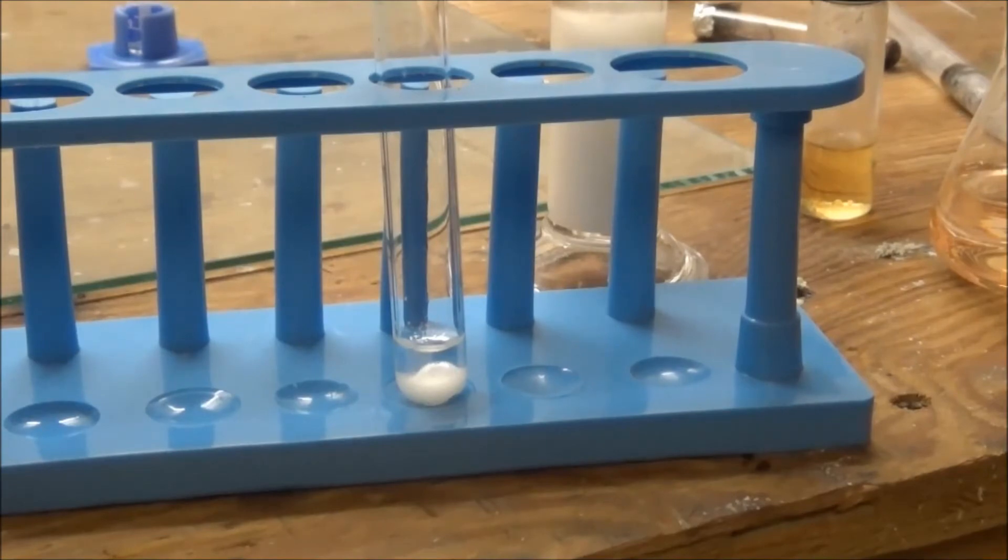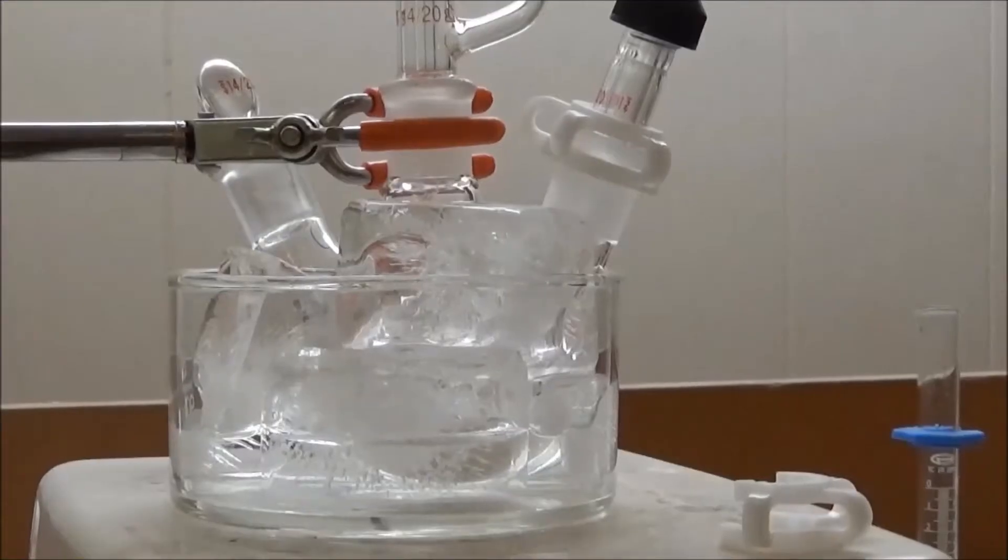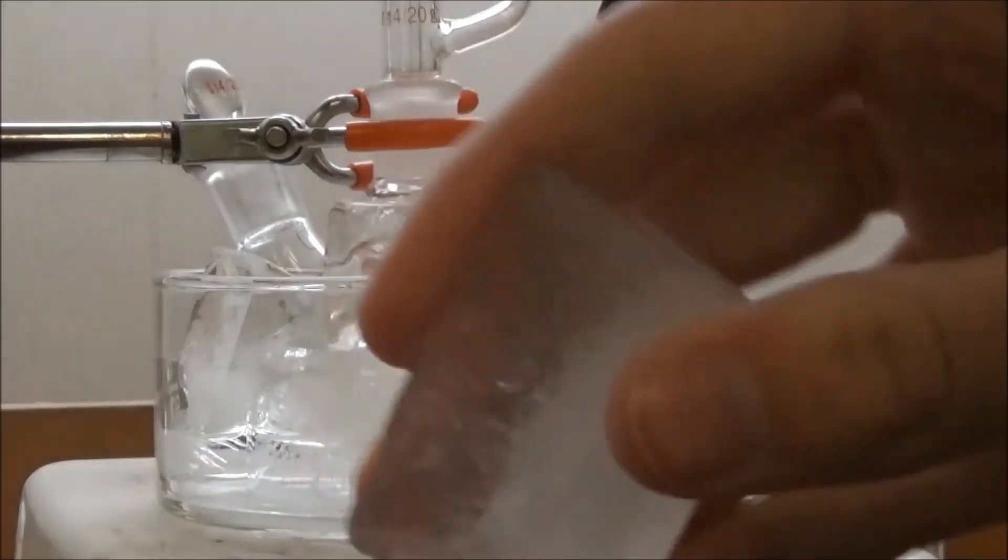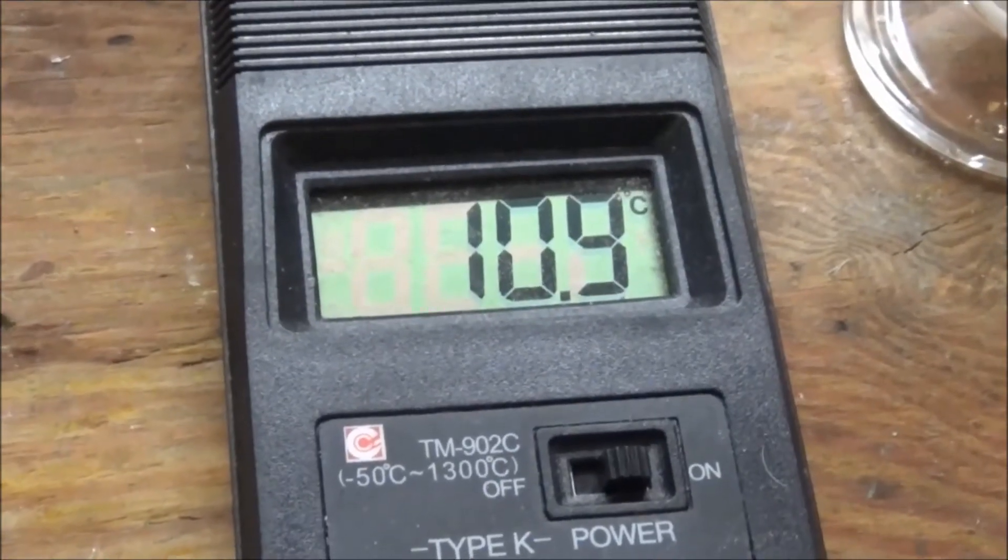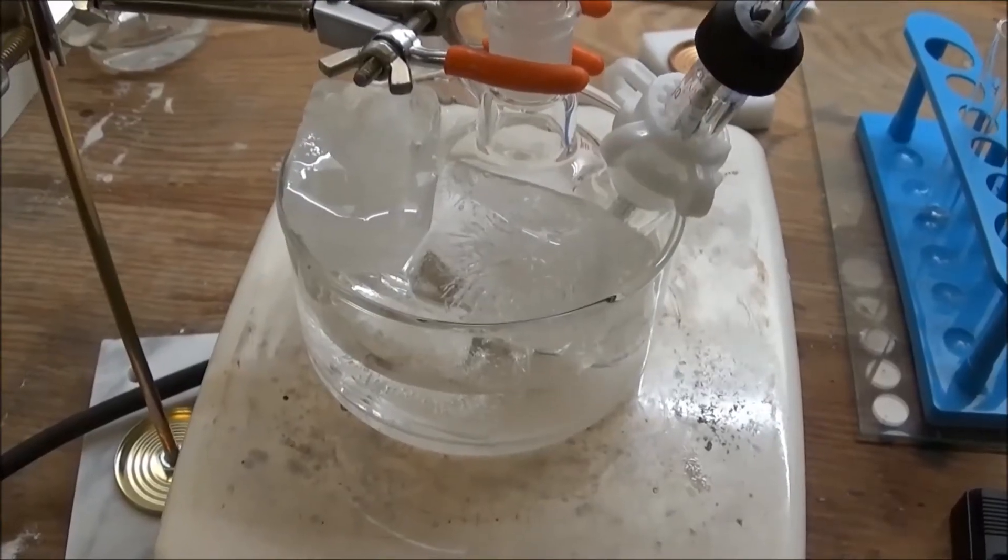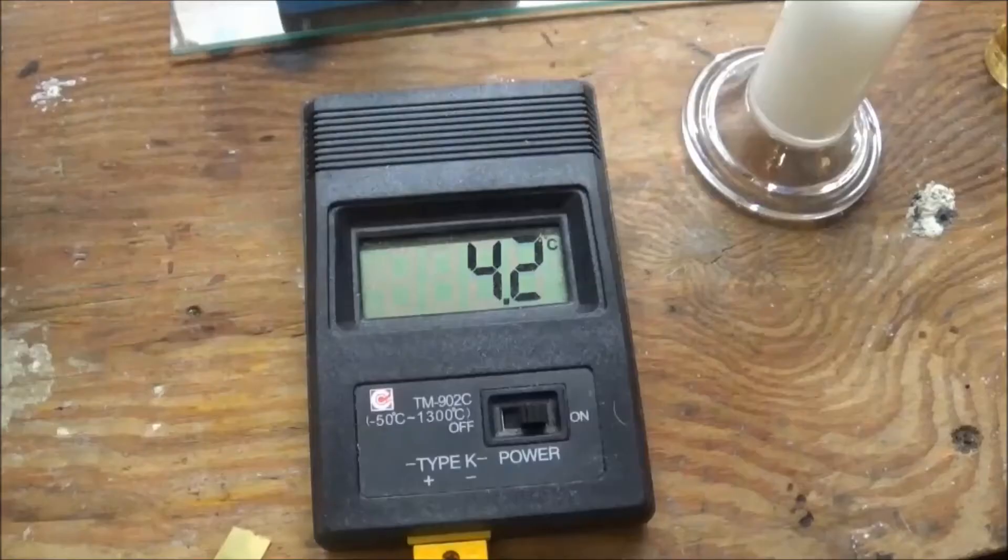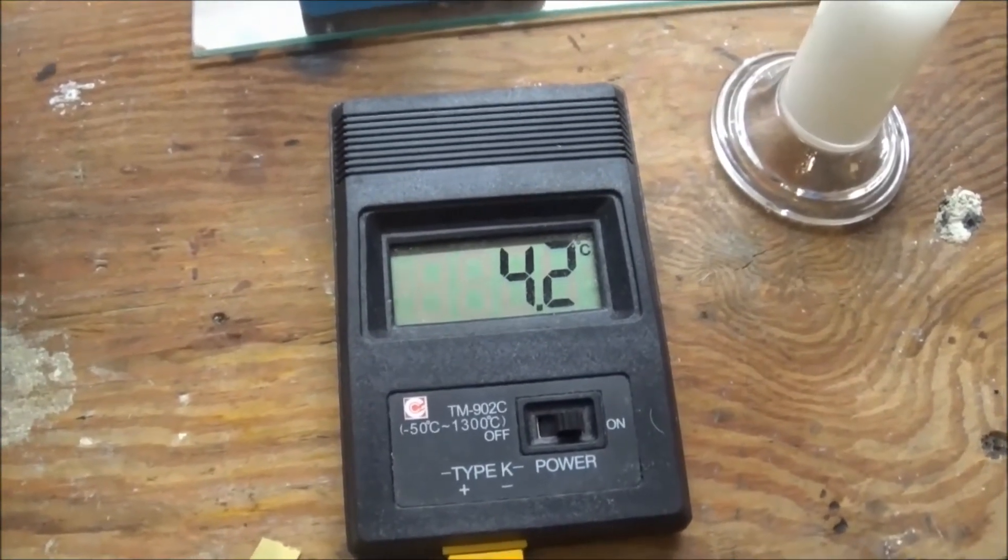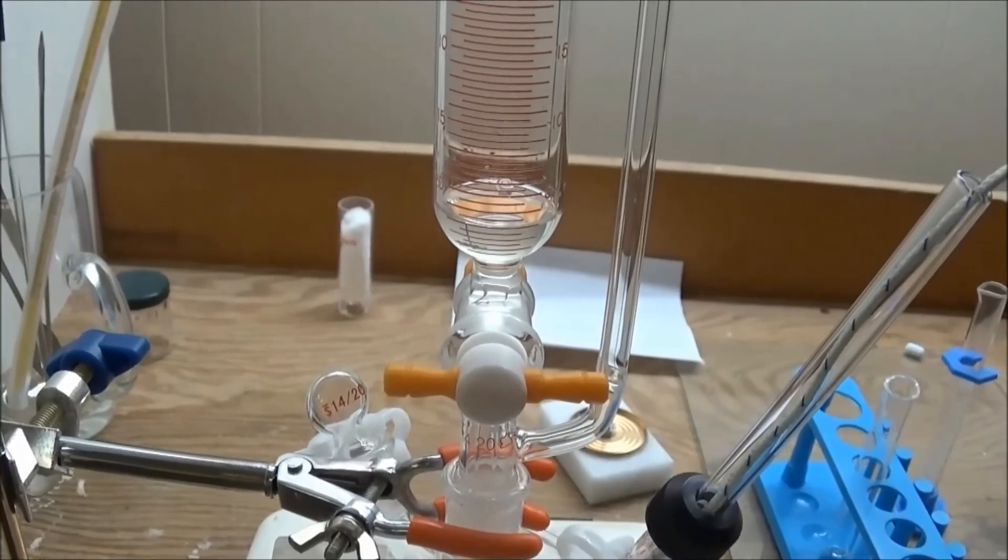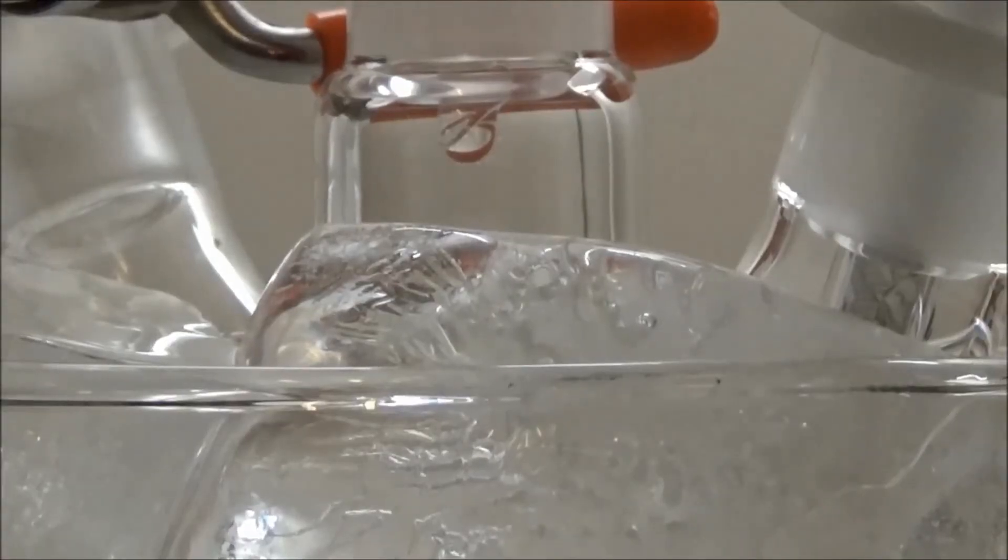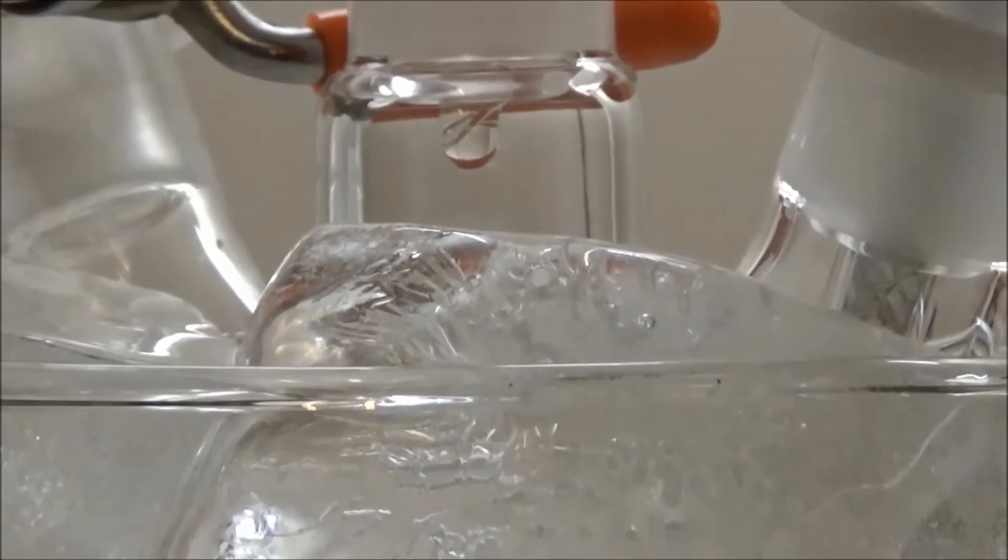While I left that dissolving, I set up an ice bath around my flask. This reaction needs to take place between 0 and 5 degrees Celsius, so I let it cool down as the sodium nitrite dissolved. Once I reached the right temperature, I added the solution of sodium nitrite to the addition funnel and began addition. I had to play with the speed a lot, turning on and off, but eventually got a good rate and could leave it going.